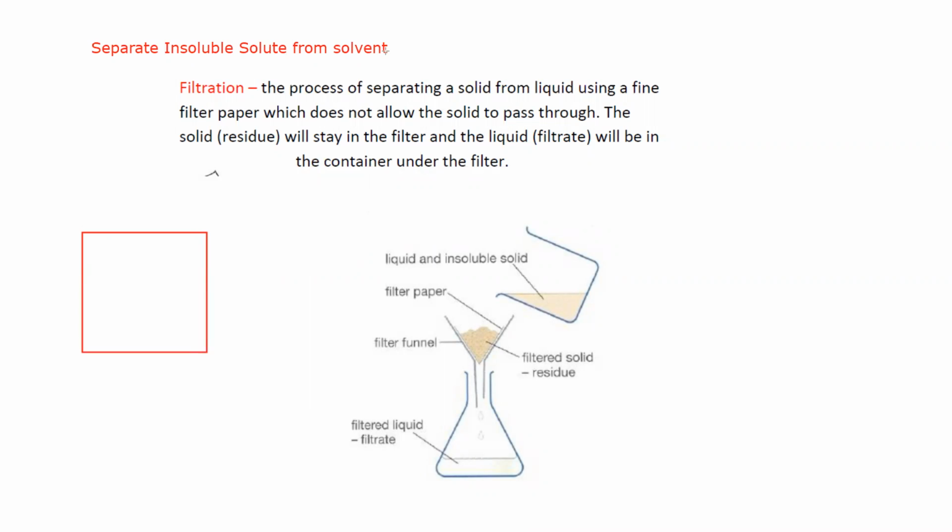Example: you have a container which is filled with water as a solvent, and you have silver chloride. Silver chloride is an insoluble solute.